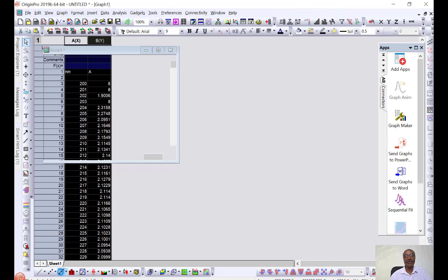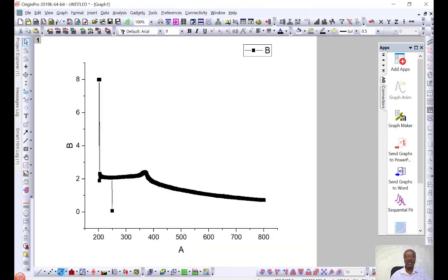You know, when you do an experiment and collect the raw data, there could be some errors. Yeah, as I expected. Here there is one data point which is around wavelength of 203, absorbance of 8, and here there is also another one. So these values are erroneous. They are actually unexpected values or errors. So let me remove them to smooth this window.